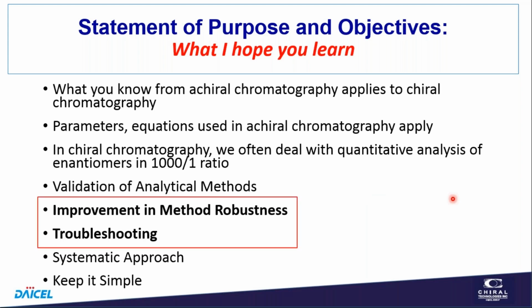As I was putting this talk together, I realized or was thinking about the things that I do on troubleshooting, and many of the same tests and questions we have in method robustness are issues around troubleshooting. I don't have time to talk about troubleshooting per se, but I did want to point this out. Many of the things we investigate in method robustness are the same kinds of experiments or tests that we would do in troubleshooting.